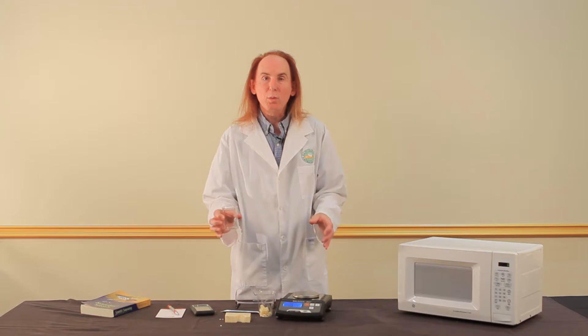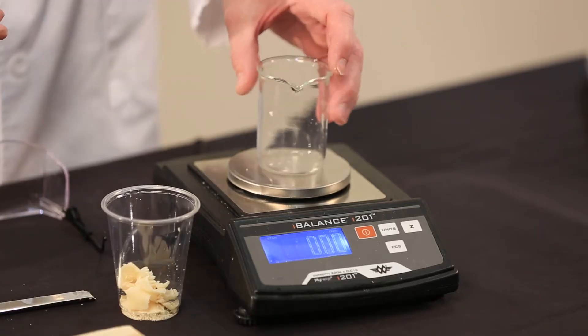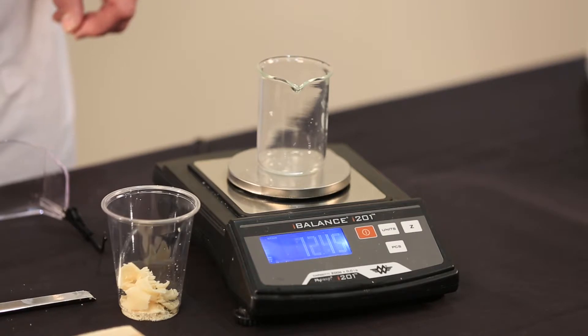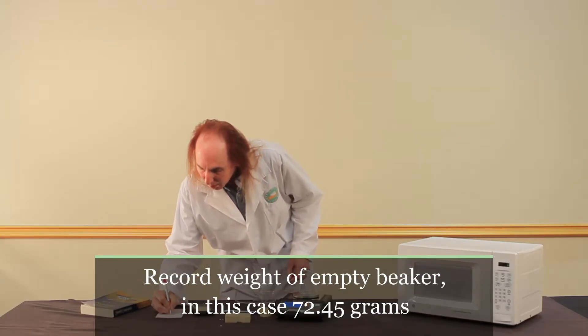So the first weight that we need is the empty weight of the beaker. I've zeroed the balance, I press the beaker on the balance, and I'm going to record 72.45 grams. Empty weight.